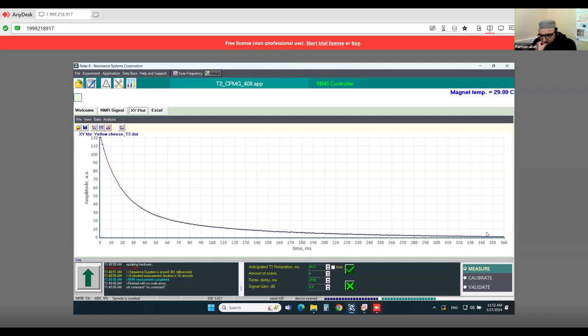Emil Cobra, this is a student from Turkey, so let me confirm that the sample is changed. Yes, it's ready again. Okay, thank you.